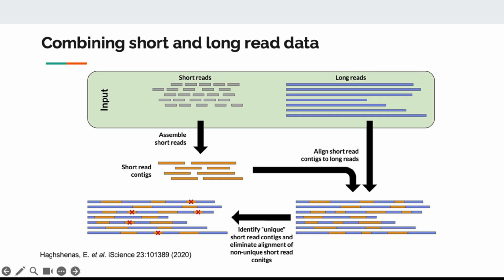So the long read will serve as your scaffold, as your template. You might not be confident with the nucleotide sequence in certain regions, but once you map all the short reads into this region, you will get 10 or 100 copies of DNA from that region. So you will start to be more confident about the actual nucleotide sequence.